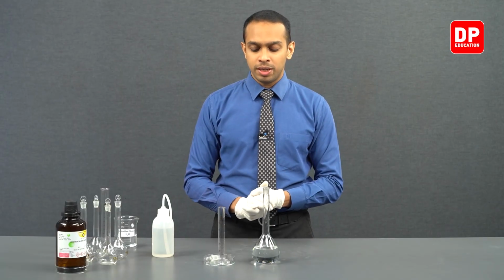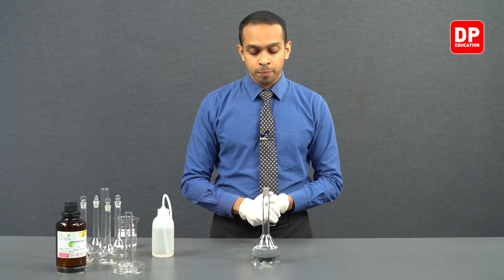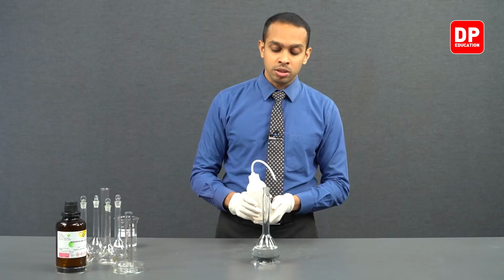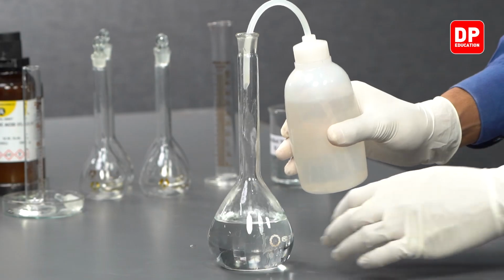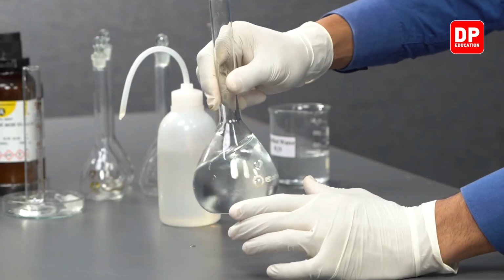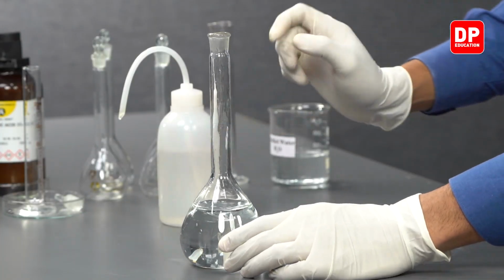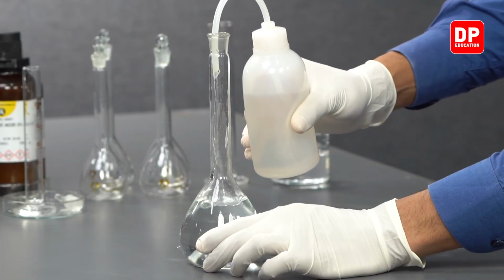Right. After we have transferred all of the HCl into our volumetric flask, we can proceed to add water up to our calibration mark. We can use a wash bottle for this purpose. We can slowly add a little bit of water and you can mix the solution really well like this. And then you can proceed to add water all the way up to the calibration mark.